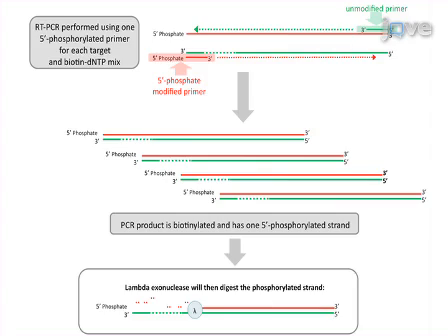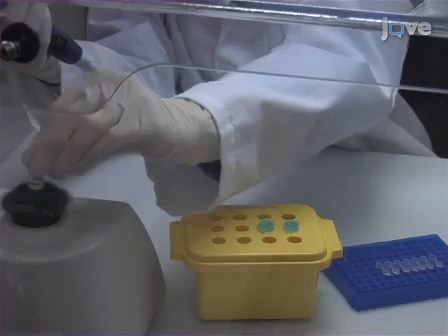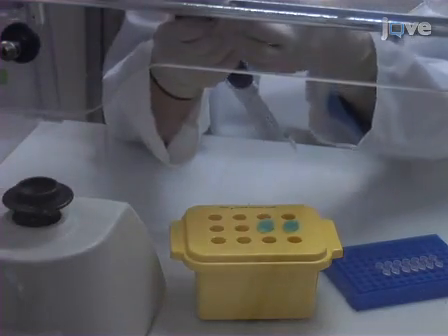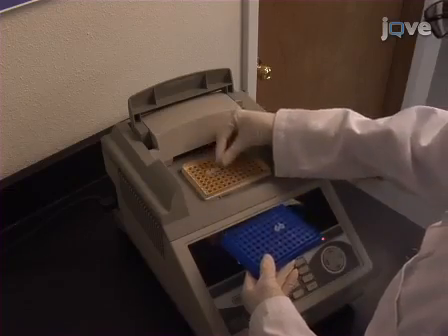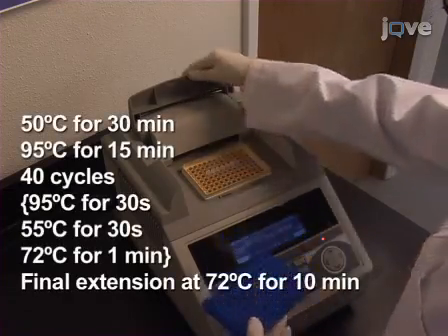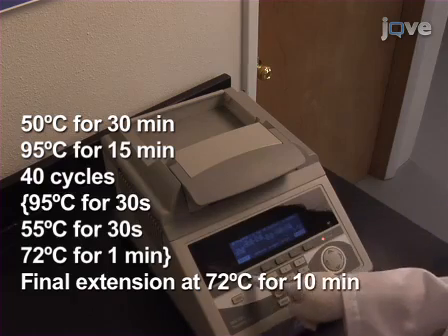The Flu-A primer set produces a 1032 base pair product, and the Flu-B primer set produces an 811 base pair product. Briefly vortex and distribute 18 microliters of master mix into thin-walled PCR tubes, then add 2 microliters of RNA template to each reaction tube. Transfer PCR tubes to a thermal cycler and use a cycling profile with an appropriate annealing temperature, as shown.